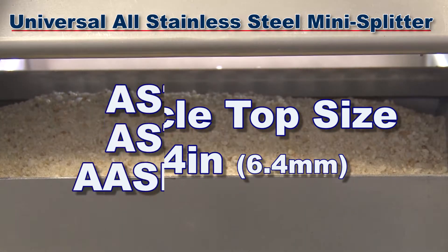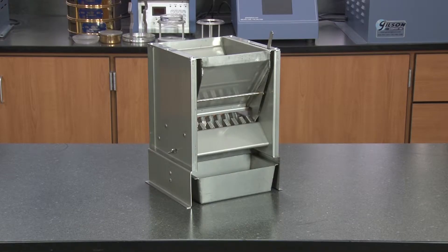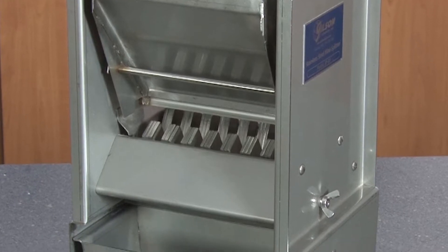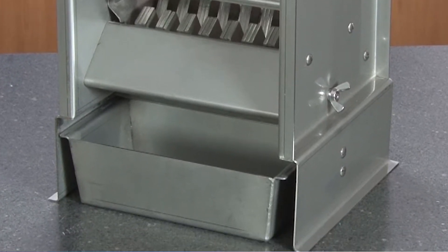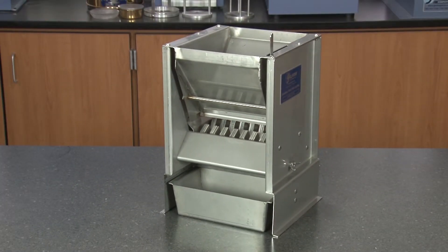The SB33 meets the requirements of ASTM and AASHTO standards. The rugged SB33 is constructed entirely of high quality stainless steel, including chute bars and sample pans, for enhanced durability and reduced risk of sample contamination.